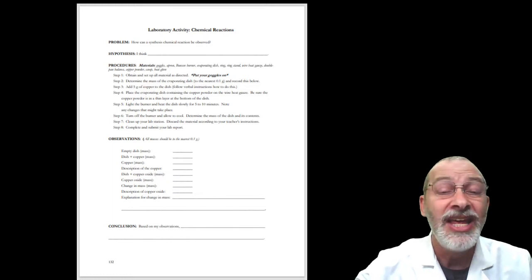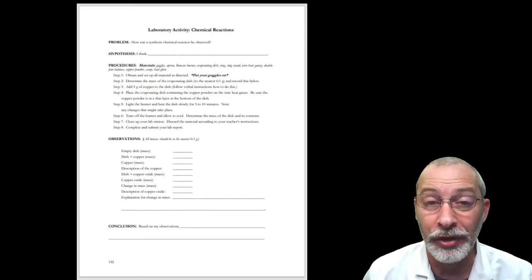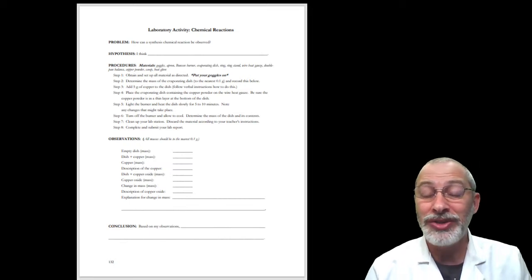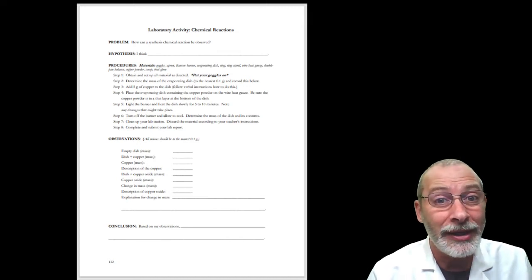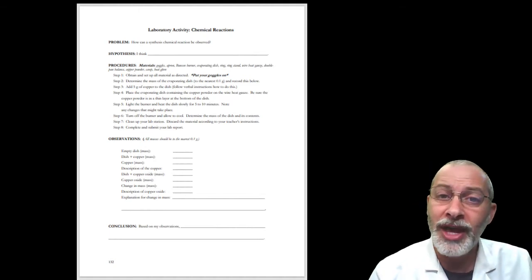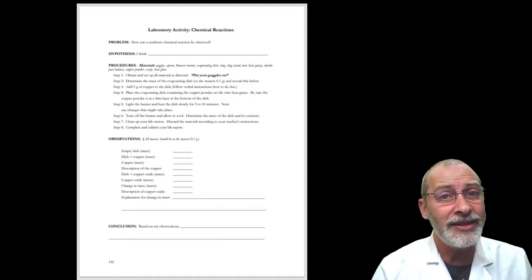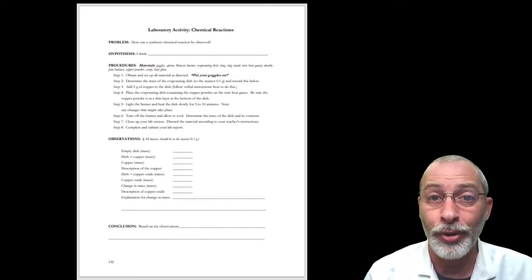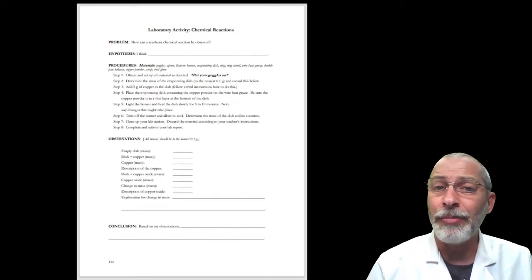And the problem today states, how can a synthesis chemical reaction be observed? To help you out, I want you to review your notes and perhaps even the video from the first day of this week. Hint, hint. Take a moment to review that information and then write a hypothesis in a complete sentence trying to answer the question stated in the problem. So pause this video until you've written your hypothesis.